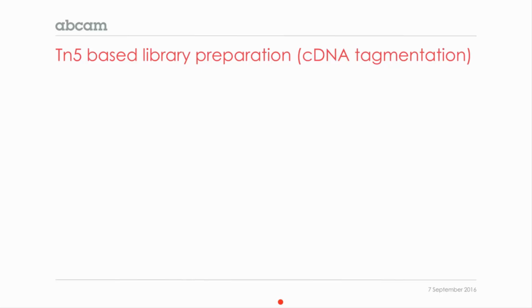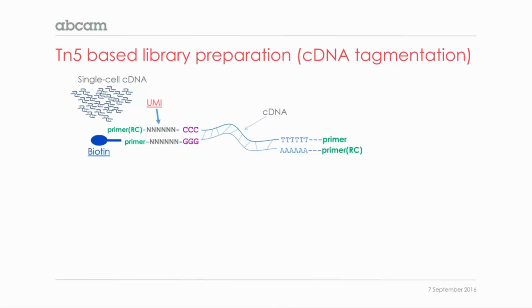So we do the library preparation of this protocol using Tn5. And this is basically similar to the Illumina Nextera protocol. So we start with, again, a relatively large amount, nanograms, of single-cell cDNA. And this is how it looks after the amplification. Again, I'm looking now at a single molecule, so it's double-stranded now. Again, we have one side with the poly-T and one side with the UMI.